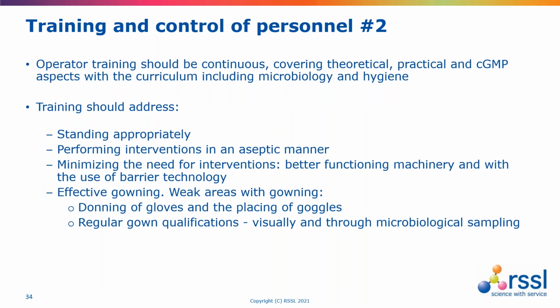And then beyond that, we should balance theoretical and practical knowledge and capture things like how to stand properly within a clean room when not engaged in an activity. About aseptic processing, a fundamental understanding that there's no such thing as a safe intervention, and the need to minimize interventions and treat them very, very carefully. And then the areas with the whole transfer, looping back to the transfer disinfection, and also the ability to gown correctly and to gown in a controlled manner.